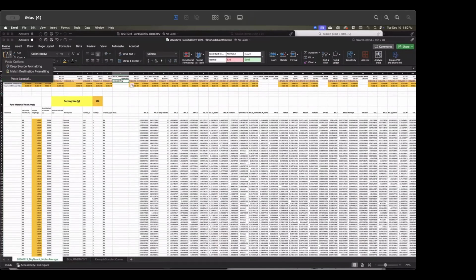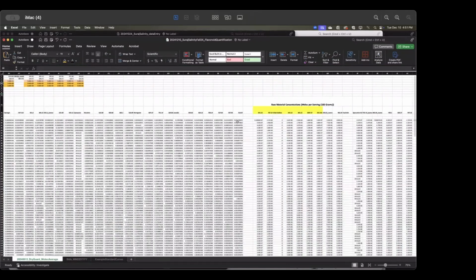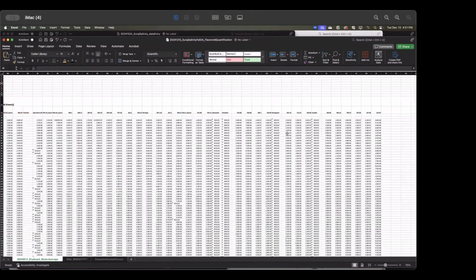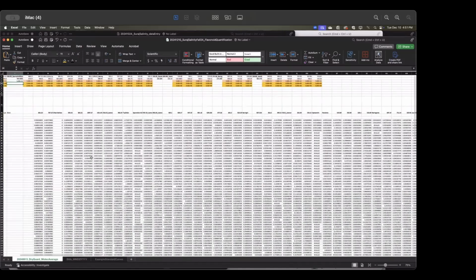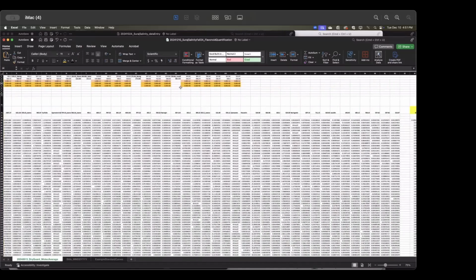Paste. Okay, and so you can see that we have that X in there, so we just have to delete that X so it becomes a number. You can see here now we're actually getting numbers over here for the most part. So it's automatically calculating, using the slope of quercetin 3-glucoside to estimate pretty much all of these glycosylated flavonoids. Now, there's a handful here that we'll have to just snag the slope for, but that's just the same process as we did before.